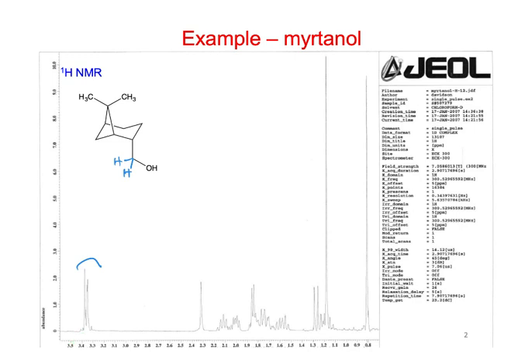I think these two protons are diastereotopic, and their chemical shifts are just very slightly different. But they're coupling strongly to each other, and so this is a very second-order diastereotopic pair of protons.